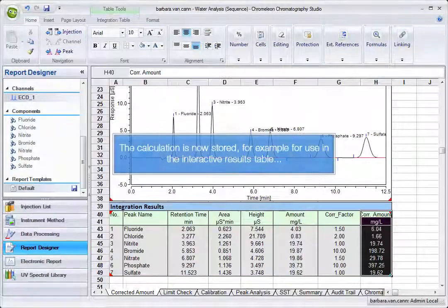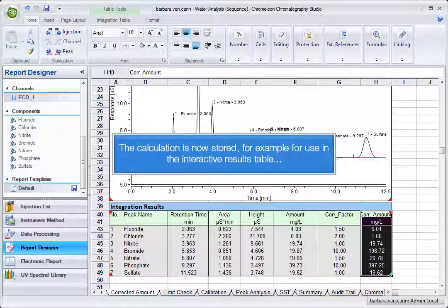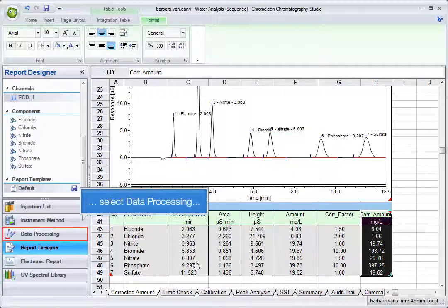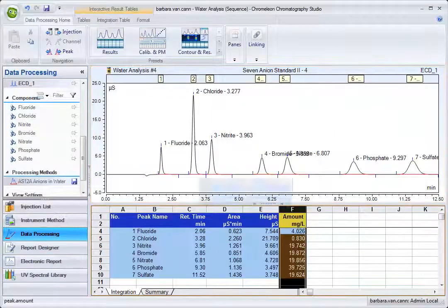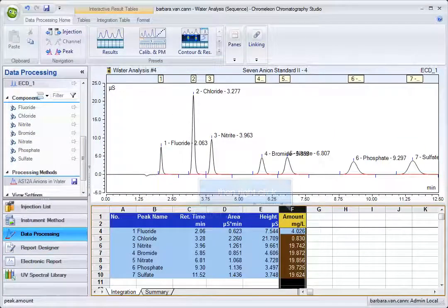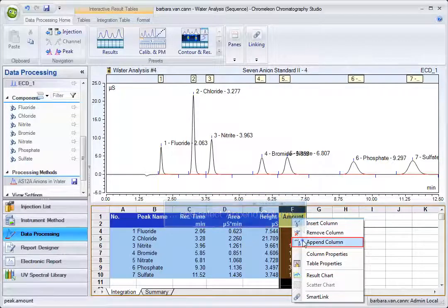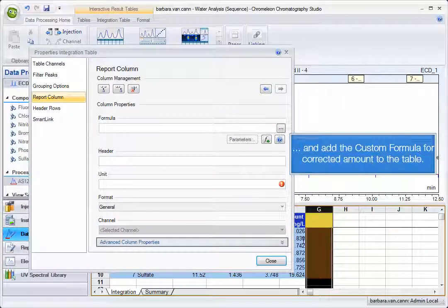The calculation is now stored. For example, for use in the interactive results table. Select Data Processing, then right-click and select Append Column. Add the Custom Formula for corrected amount to the table.